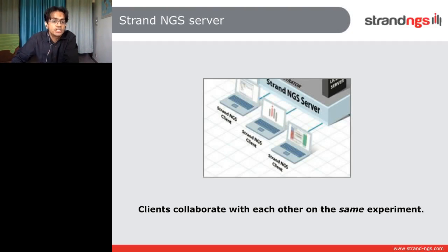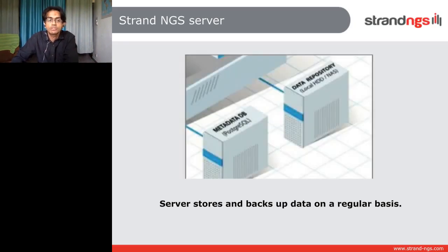It could be just a particular individual with a particular disease that you are trying to analyze and interpret, and that corresponds to one experiment. And all these different clients are working on different aspects of that experiment, just as we wanted. And of course, you have backups, and this is almost a given with the server setup, you want data backups. You just want to make sure that your data is all safe, because remember that it's not just any data, it's patient data, so it's very valuable in many different ways.